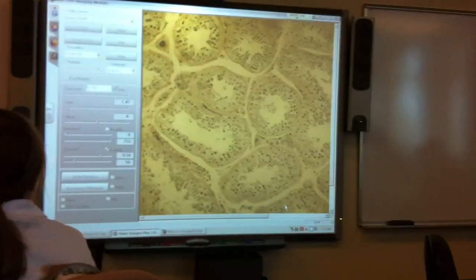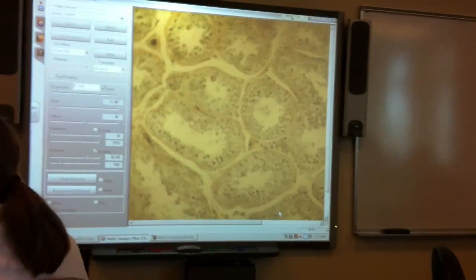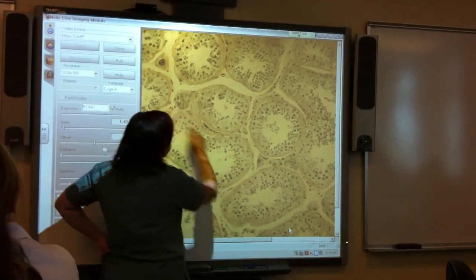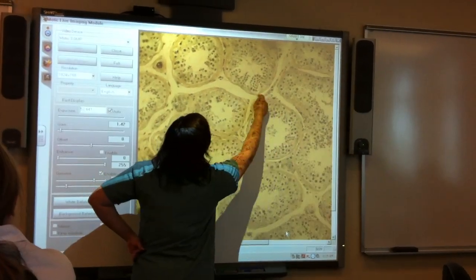So we know that these are sperm cells, or the seminiferous tubule. Each ring is a seminiferous tubule. We've got this tissue on the outside. Okay, what are these?